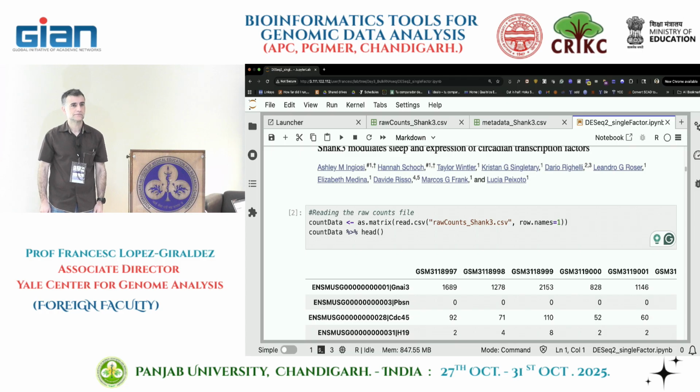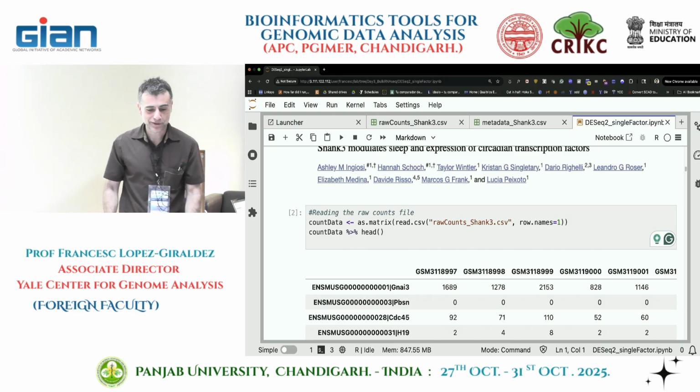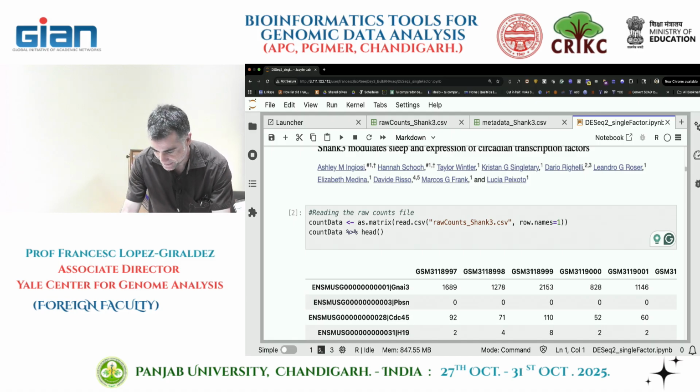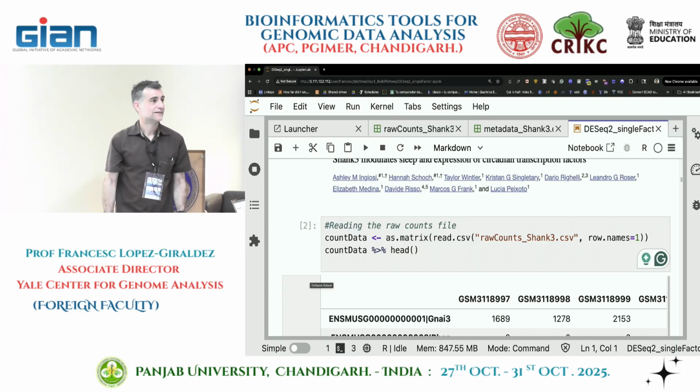Both are actually the same. Can you please expand it more? More zoom. I'm going to run out of screen space. Maybe one more. Yep.